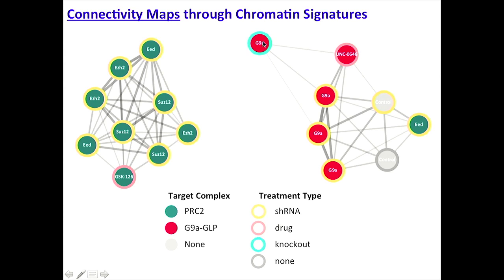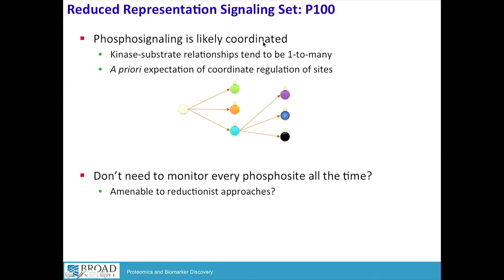The other thing that's important to say is that these samples were done weeks or even months apart. But because the assay is standardized in such a way, we're able to put everything together on the same ruler of the targeted proteomics assay panel. And in fact, those of you in the course, you've actually worked with data from this study when we did the quick walkthrough yesterday.